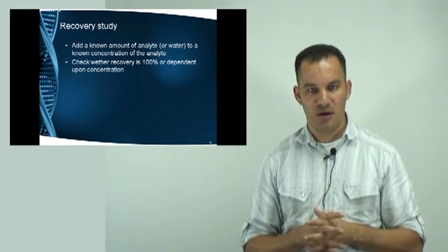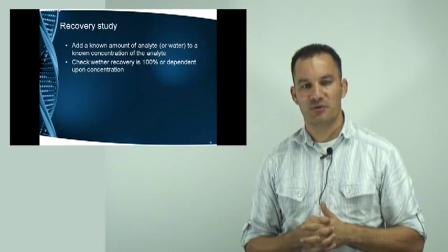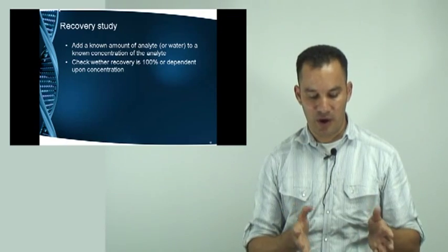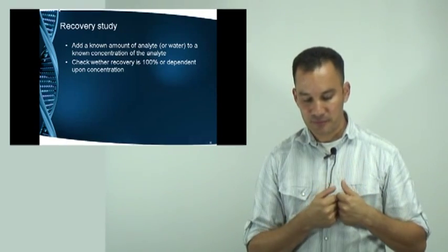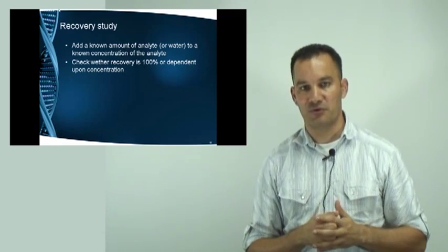So you usually have a problem performing recovery studies if you don't have the analyte purified and available from a chemical manufacturer or something.